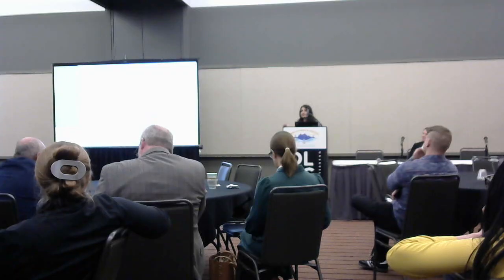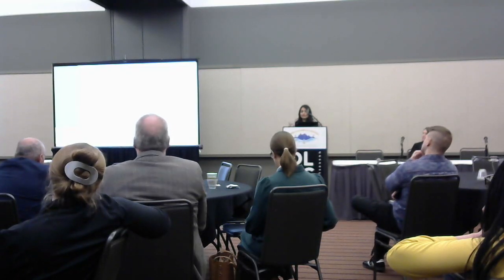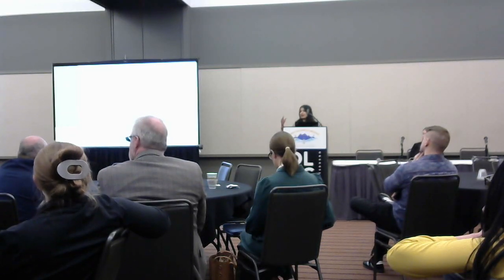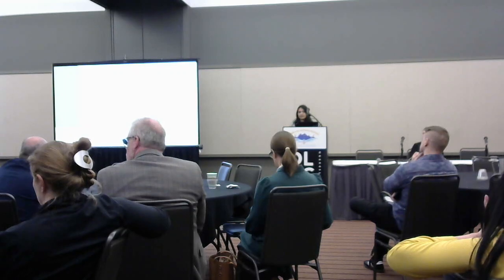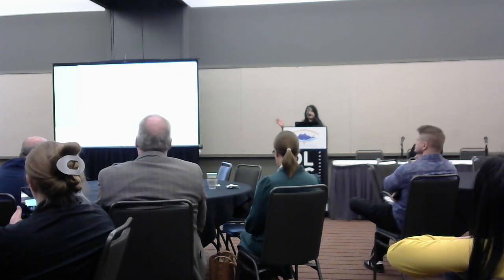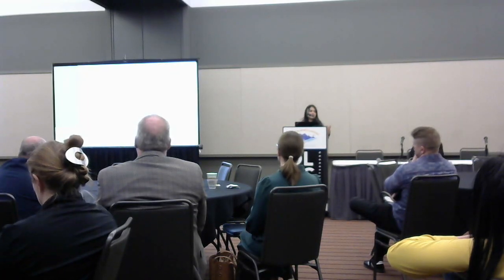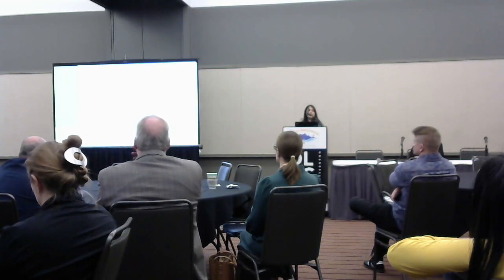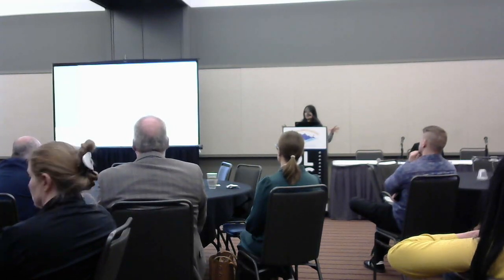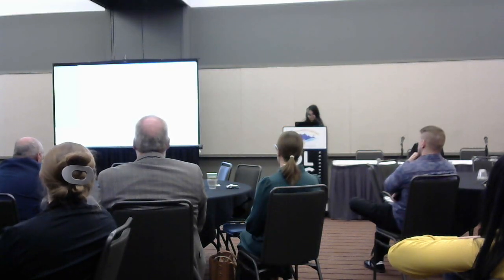In previous years, we focused a lot more on ImageJ, Fiji, and Imaris, but this year onwards, we've started focusing on Python scripts as well, just to help lower that barrier to entry and introduce people to this new system so that they can scale their analysis on the HPC. We're also working very closely with our HPC team to identify some common pipelines as pilot projects that can be used by several of our users, so they won't be scared of the command line interface anymore.